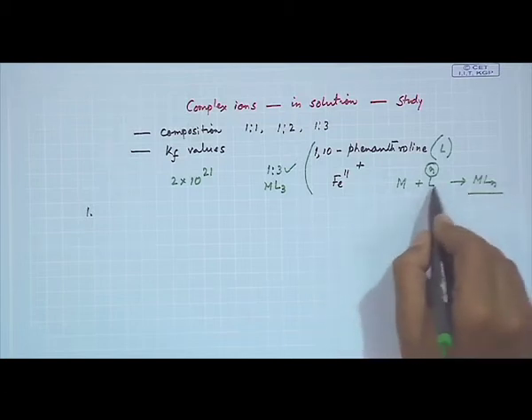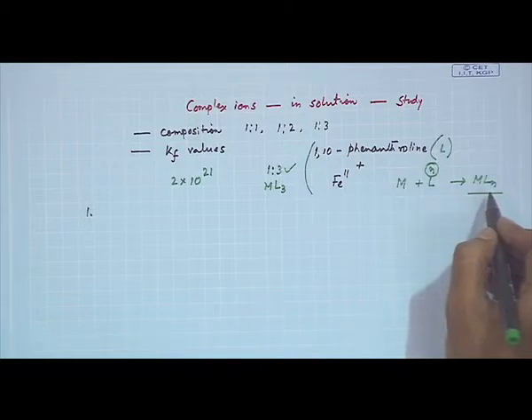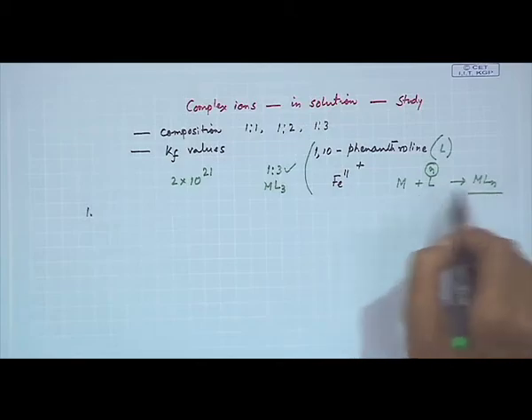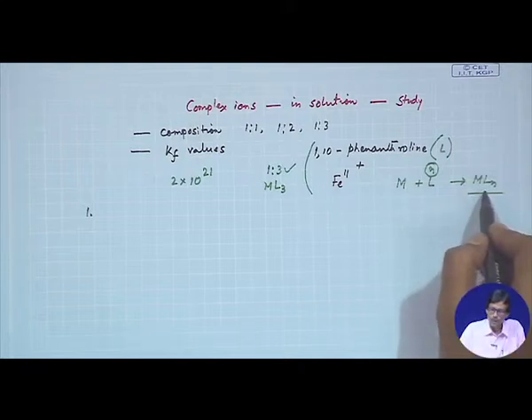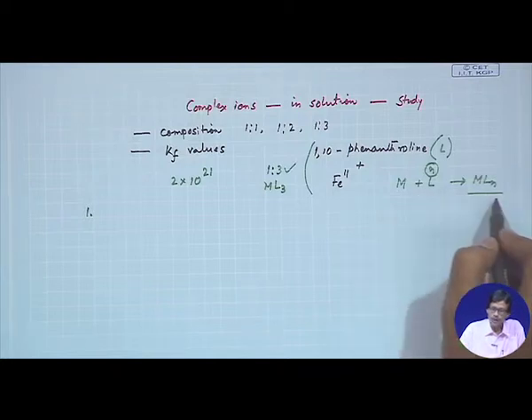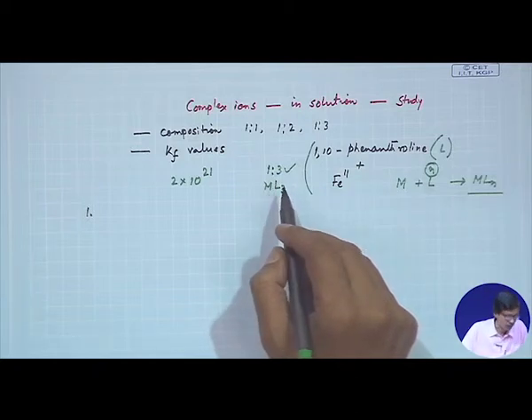If N is 6, as we have seen in the case of iron thiocyanate, when one thiocyanate is bound to the ferric ion the color changes. So, we can monitor that coloration for a stoichiometry of 1:1 only, but in some other case, until you reach the stoichiometry of 1:6, hexa coordinated with L as a monodentate, we can find out the stoichiometric composition of the metal ion.